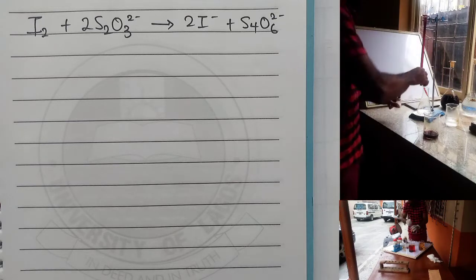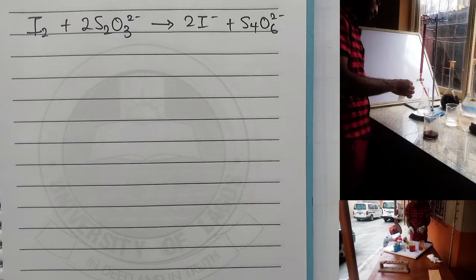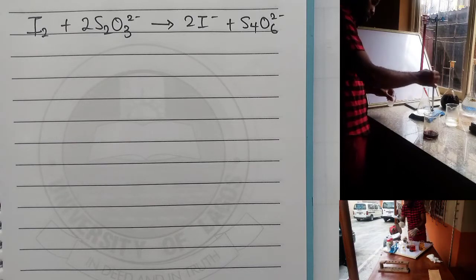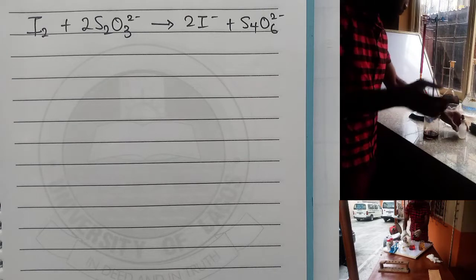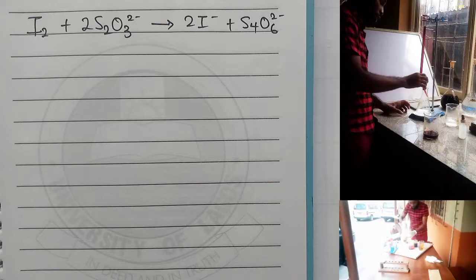I know the value you are expecting is 19 point something. No, if you use that 19 point something, you are lying, because WAEC knows the people that are lying. That means you're trying to use theoretical ideas, and the theoretical ideas you are using are faulty. Let me put something across to you. According to the normal equation, it should be like this.